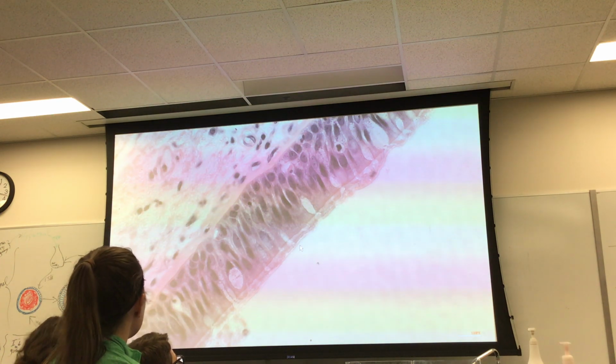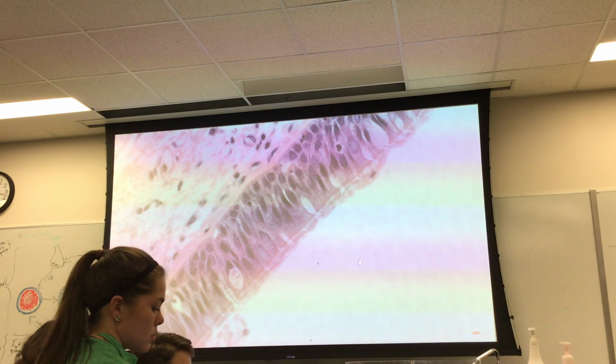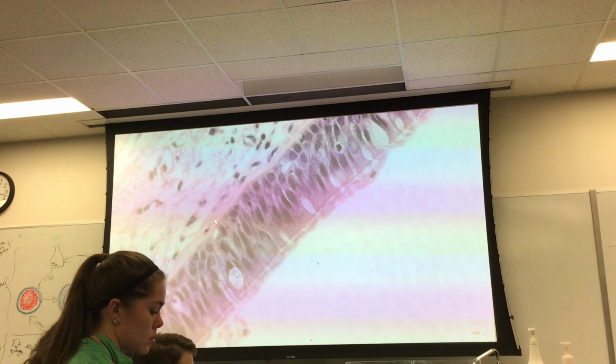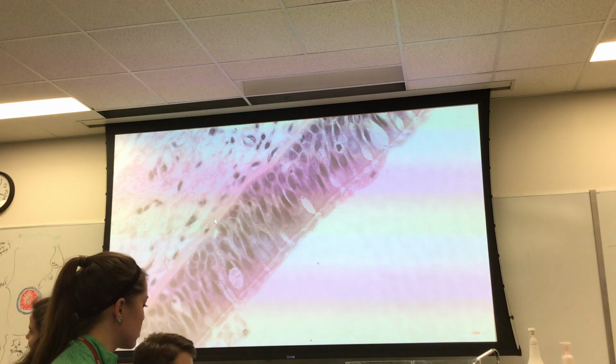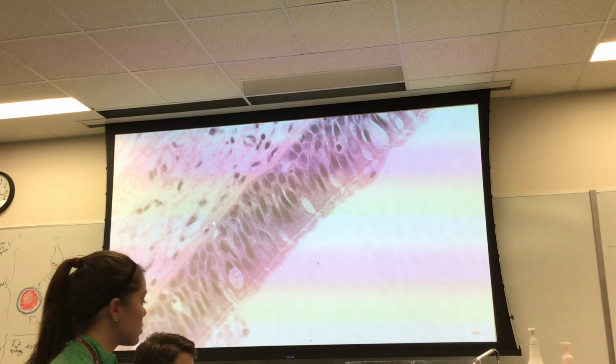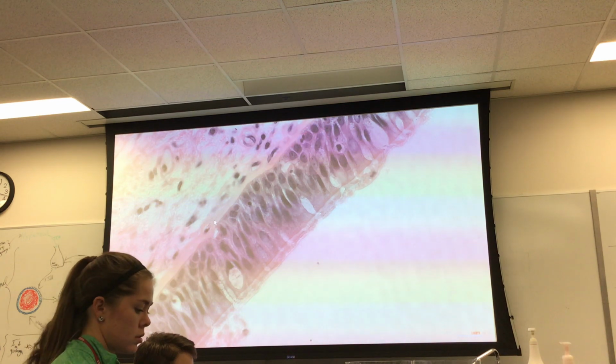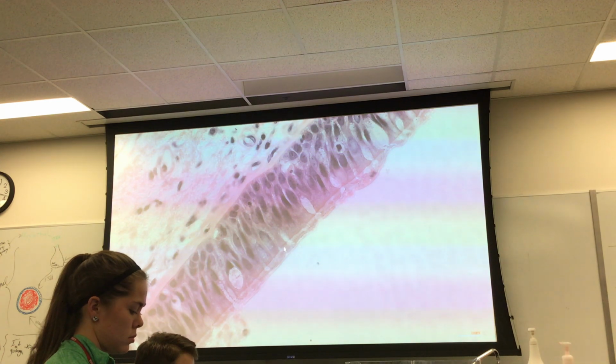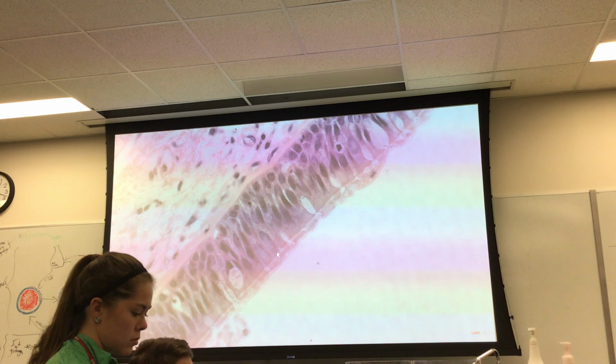So what are the things you should be looking for? Honestly, I don't know how critically important this is, but remember I said that this particular epithelium has an extremely thick basement membrane, and that's number one. Number two, the presence of multiple cell types: goblet, but the other cell that you need to see are ciliated cells.